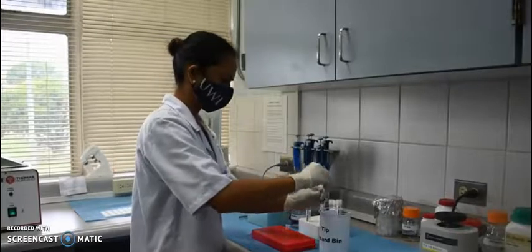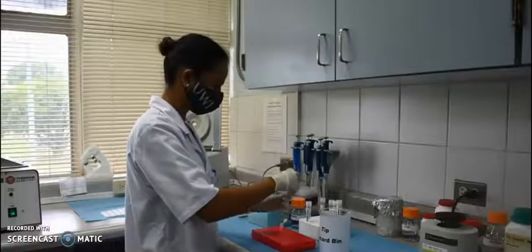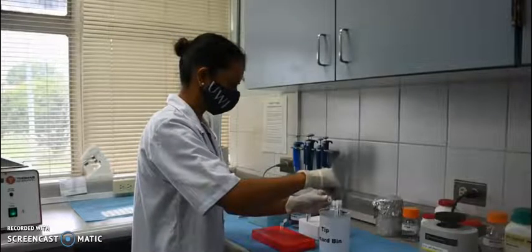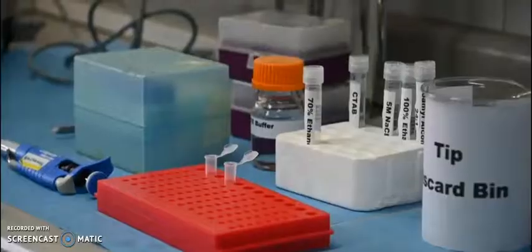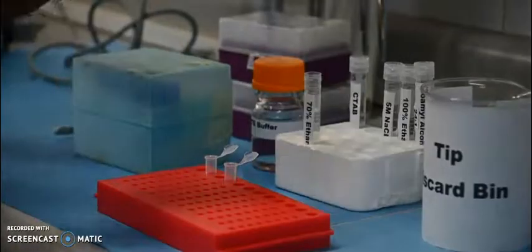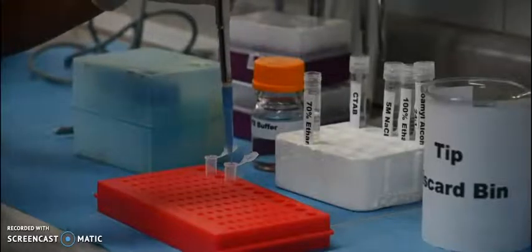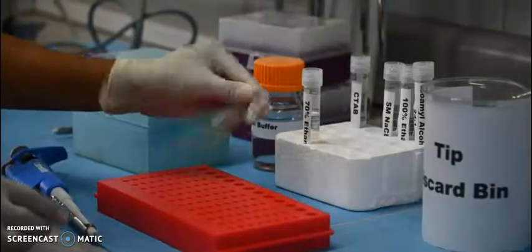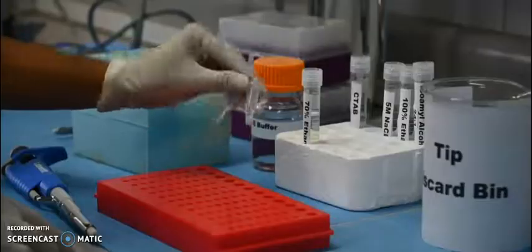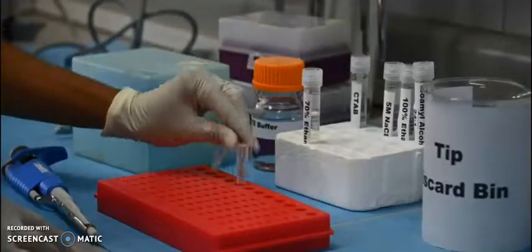After centrifuge, you can see the DNA pellet at the bottom of the tube. Now decant the supernatant and wash the pellet with 600 microliters of 70% ethanol. After addition of ethanol, mix it, then centrifuge at 10,000 RPM for 5 minutes.